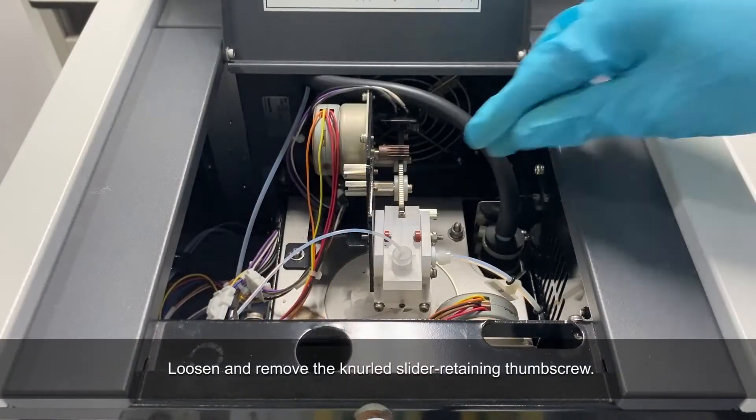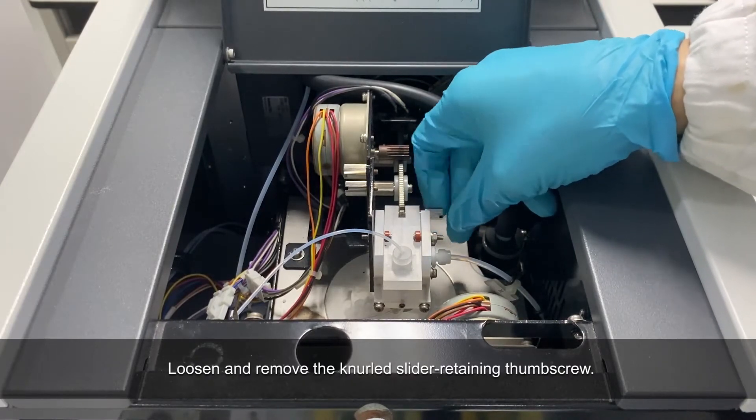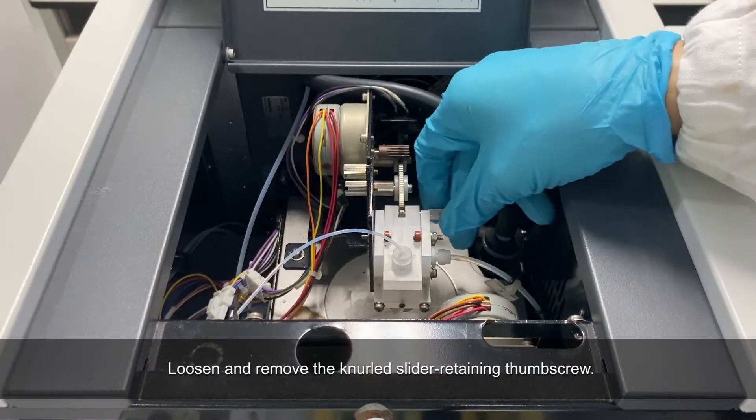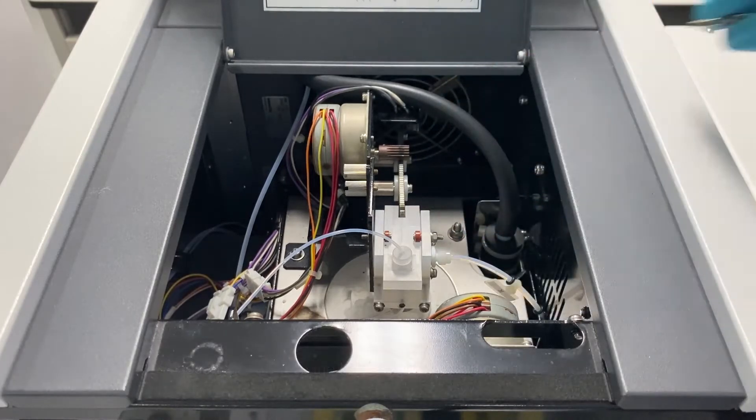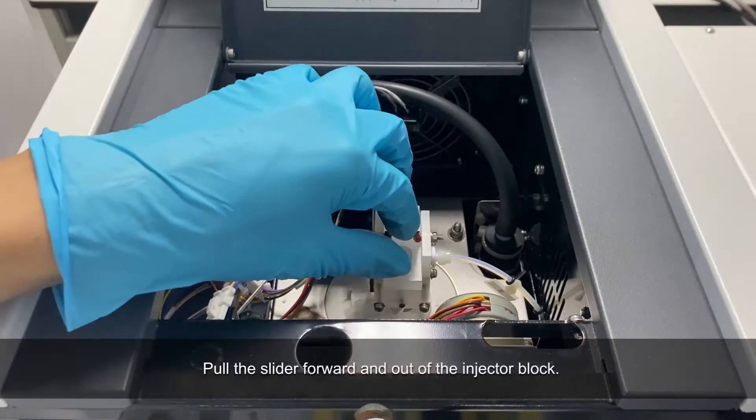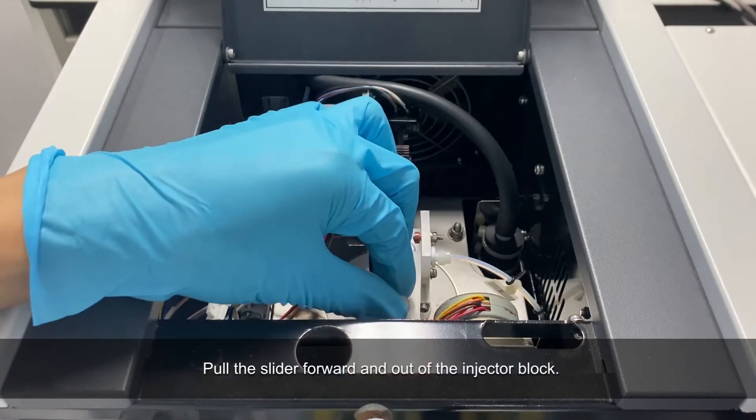Loosen and remove the slider retaining thumb screw. Pull the slider forward and out of the injector block.